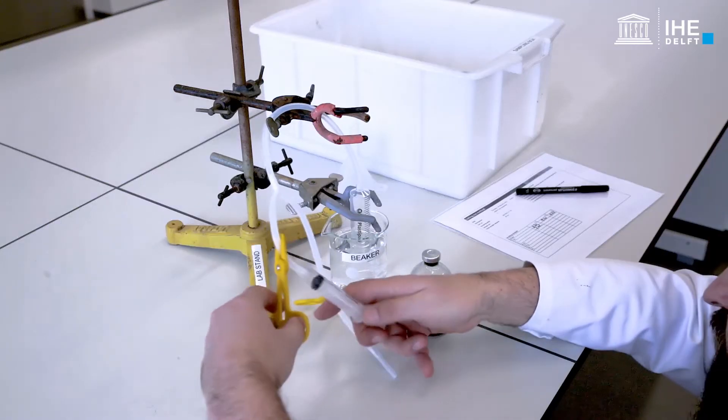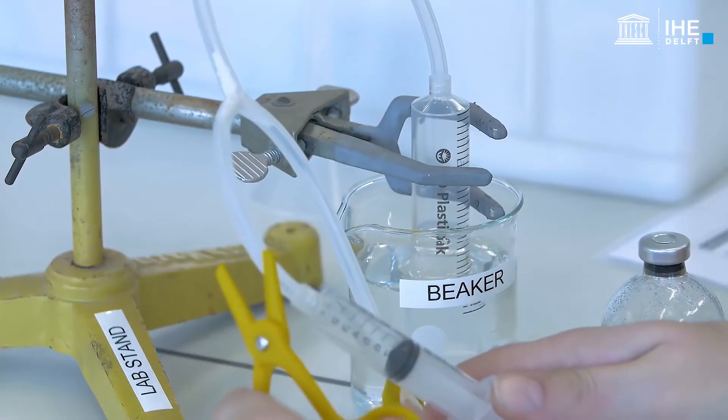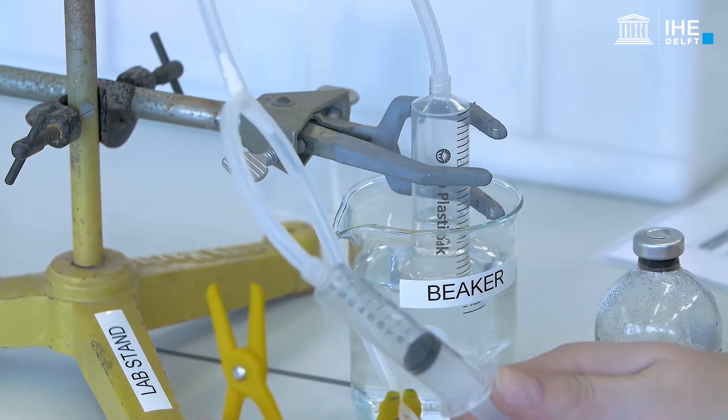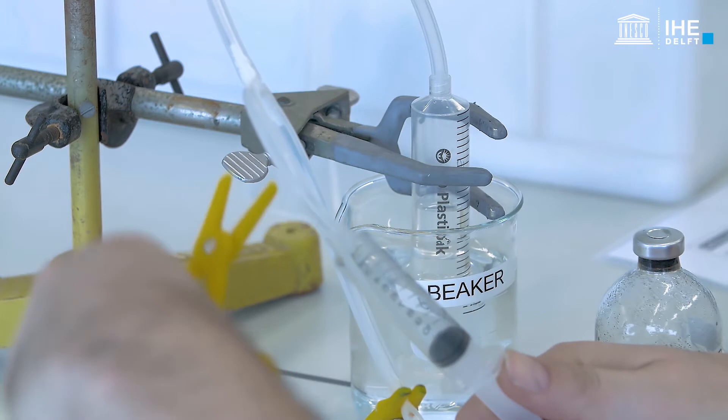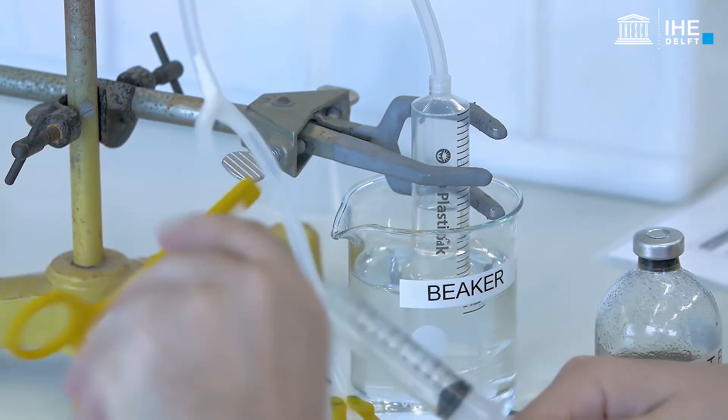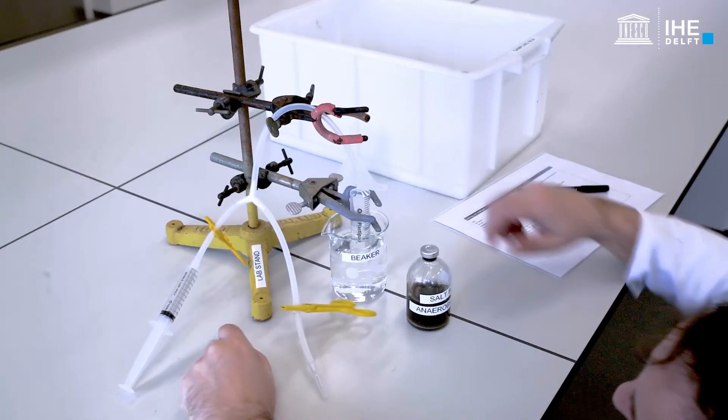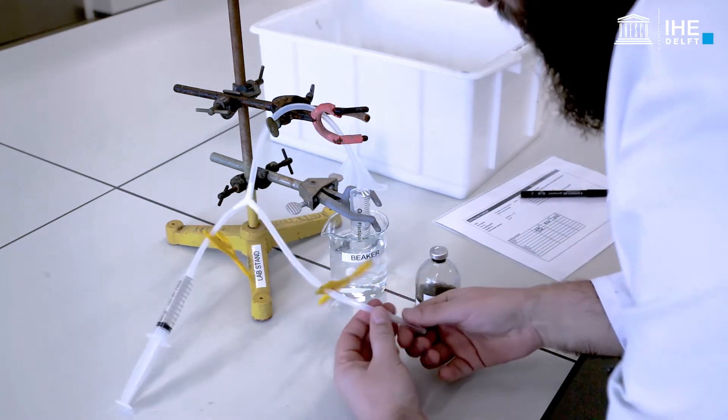Before sampling the headspace of the serum bottles to conduct the gas analysis with gas chromatography, the pressure in the headspace needs to be equilibrated with the atmospheric pressure by allowing the gas in the headspace to expand in a submerged graduated syringe and measuring the volume expansion.